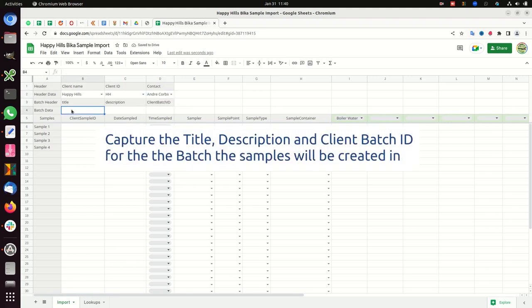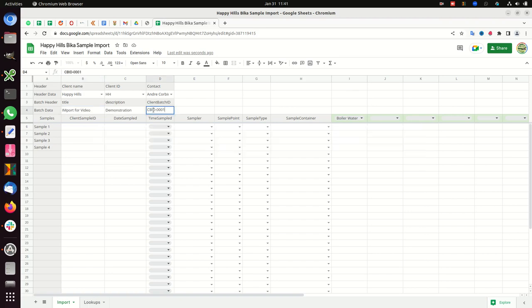Capture the title, description, and client batch ID for the batch the samples will be created in.